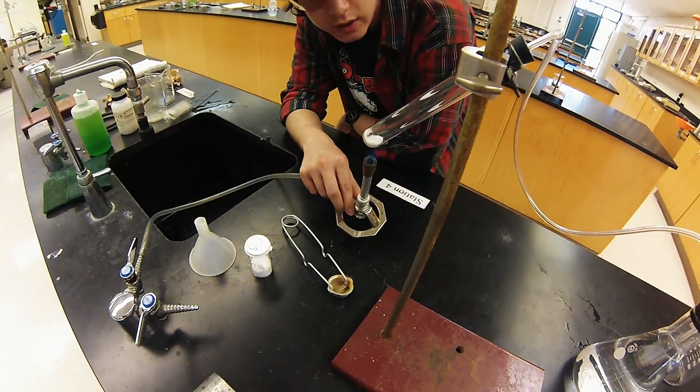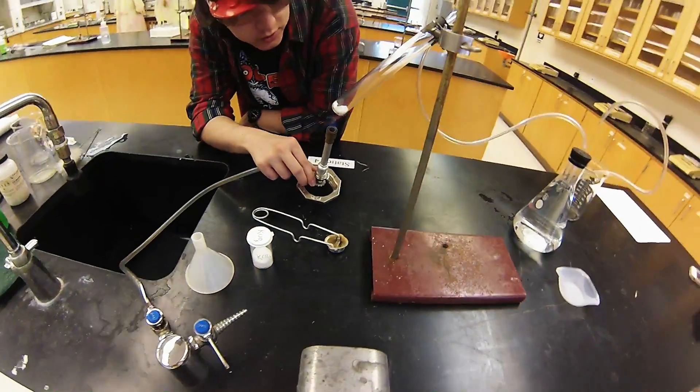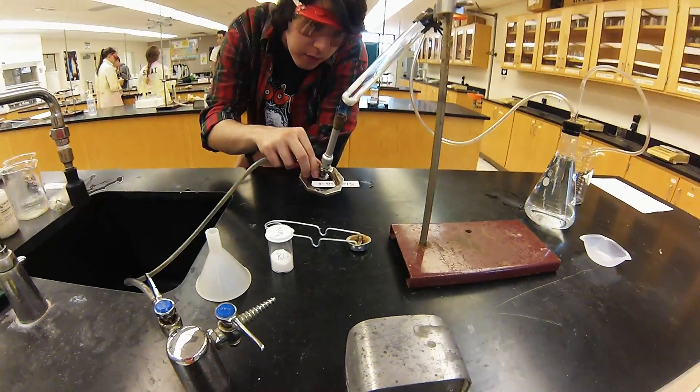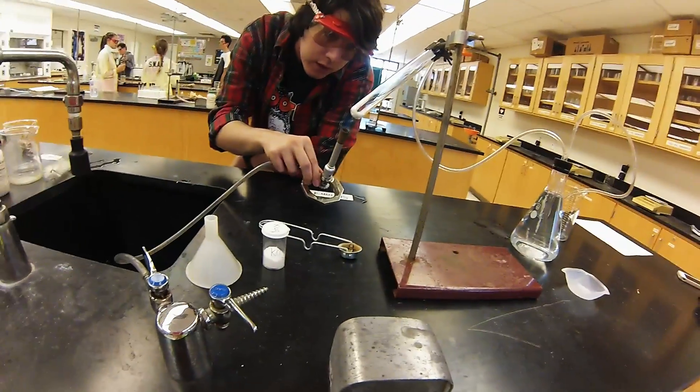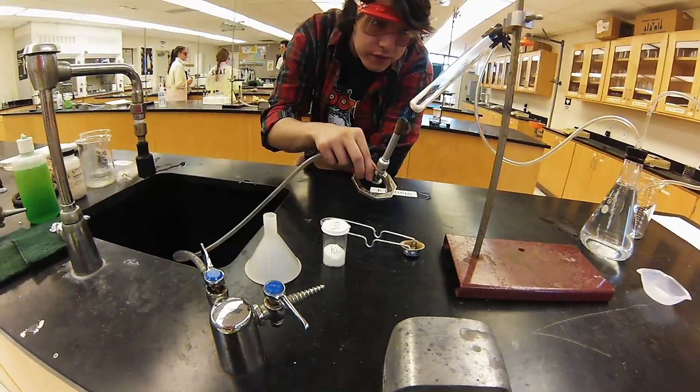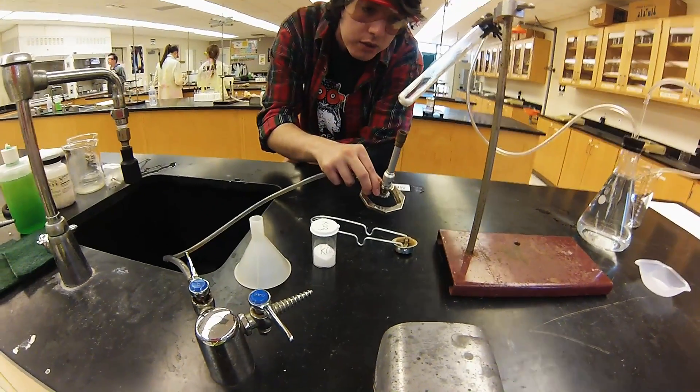When you first start heating the material, you want to make sure to pick up the Bunsen burner and sort of evenly distribute the heat throughout the sample. You don't want it just burning on the bottom at first.